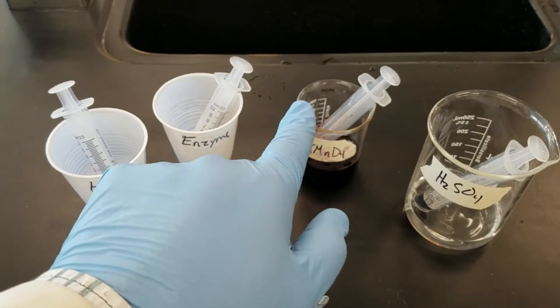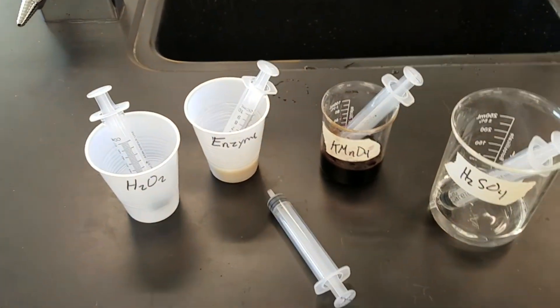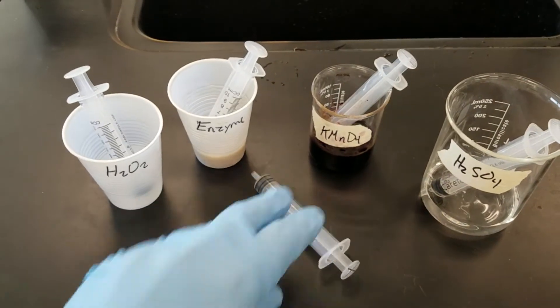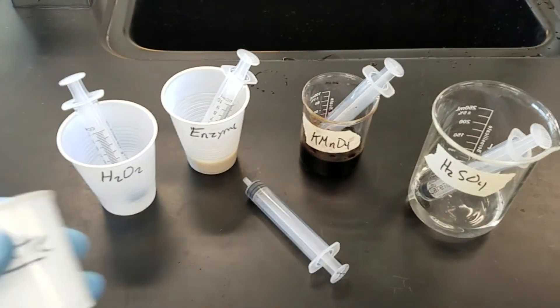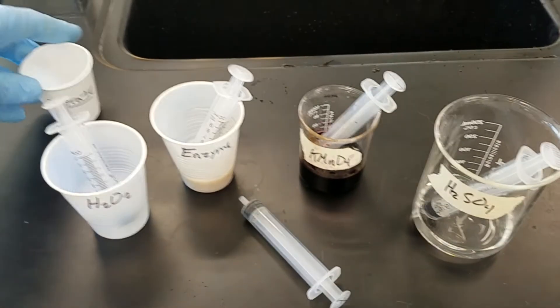Each one of these has a syringe and I'd like you to please leave them in there because we don't want to cross contaminate. There is a fifth syringe by itself with a little X on it. This one you're going to use later with your titrate cup. This titrate cup we'll just keep to the side for right now.